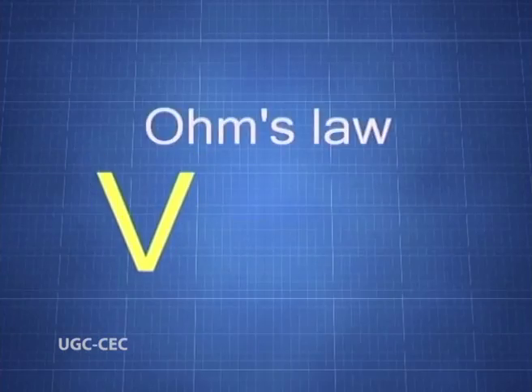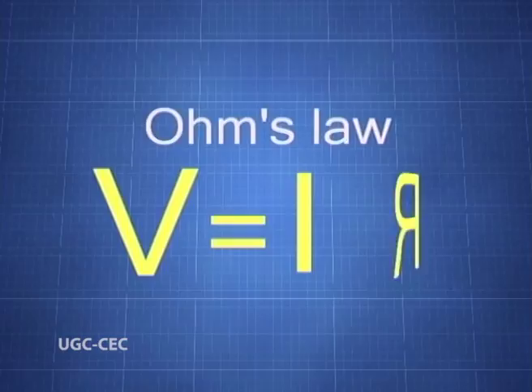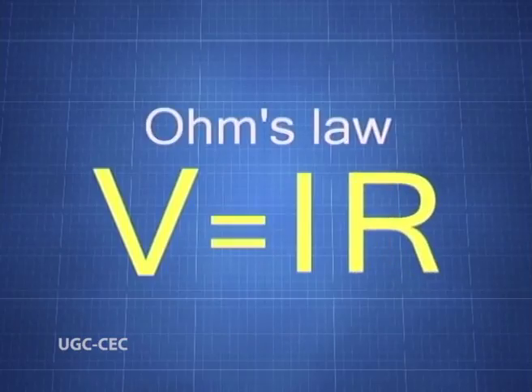For example, if an amino acid is negatively charged, it will migrate towards the positive charge, and this separation can be explained further with the help of Ohm's law. On supplying higher current, the separation is faster, and if the current is reduced or the voltage is less, then the ions migrate slowly.